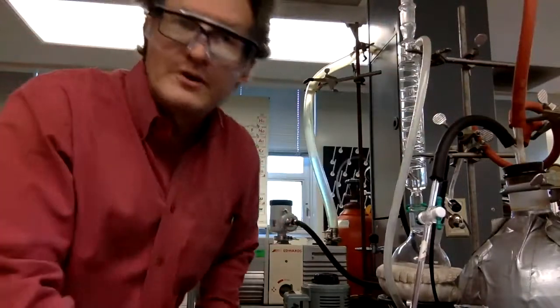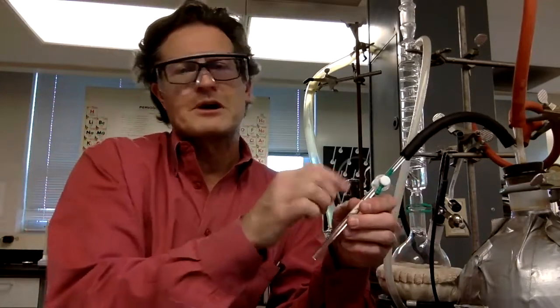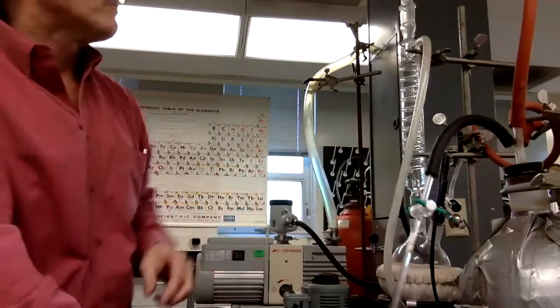Now, 2 different kinds of valves. We want to understand these 2 valves. This one, you've probably seen valves like this before. This is a simple stopcock. When it's in line parallel with the tube, it's open. When it crosses it, it's closed. This is the vent valve, where we can vent the system back up to atmosphere. We can add pressure that way.